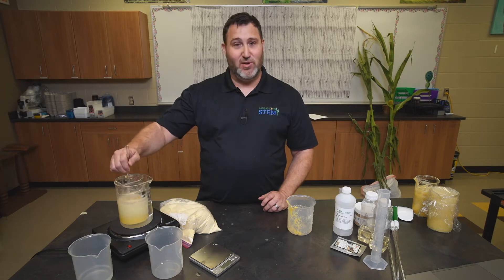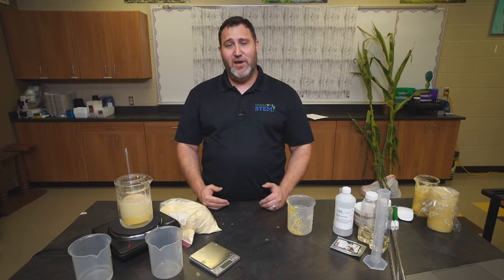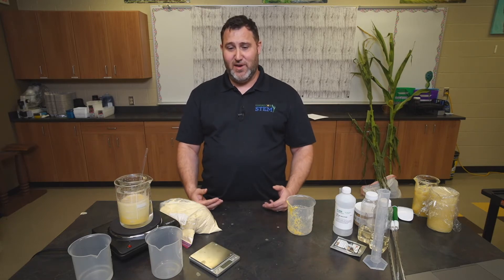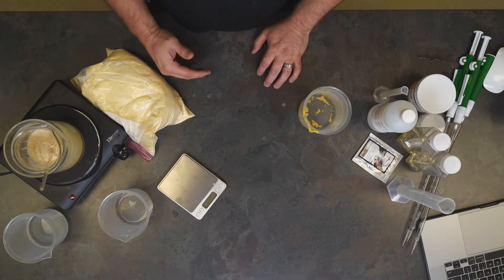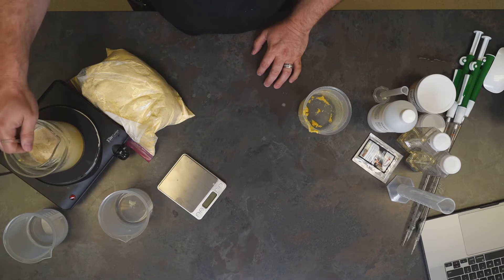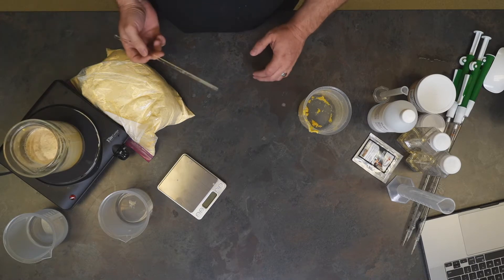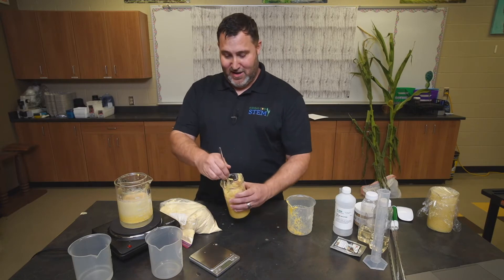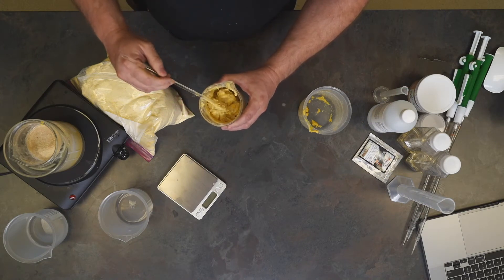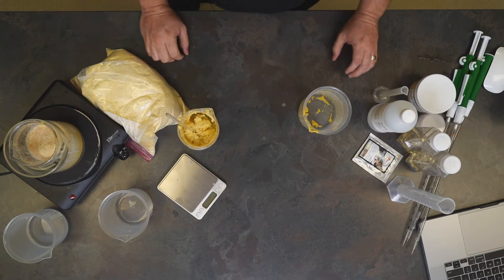You want to be stirring your corn mash periodically as it is heating. You'll know when your corn mash is ready because you're going to get a change in consistency — you might even get a small change in color. When you stir your corn mash you want it to have more of a thicker oatmeal consistency. I've already prepared one here, and you can see that it is quite a bit thicker than the corn mash we started with.